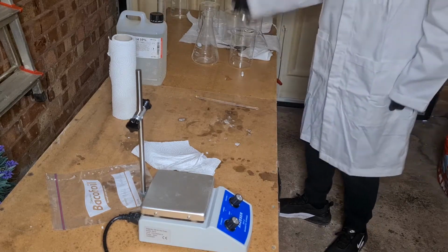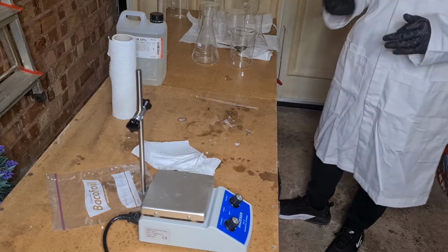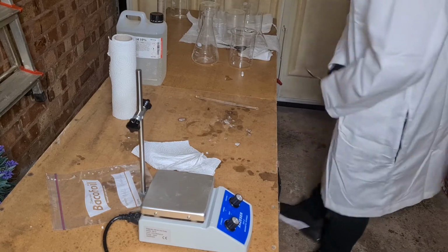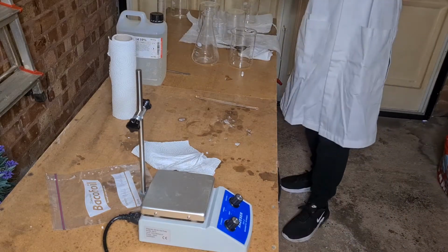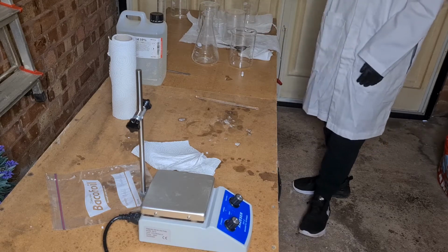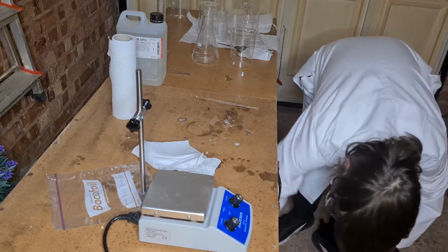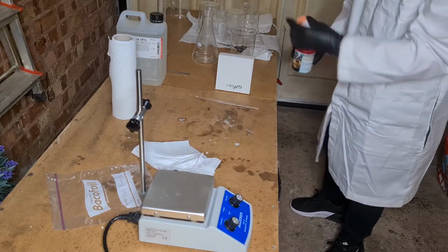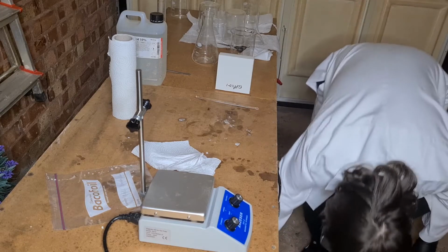Moving on, we have a teaspoon that is never going to be used in making cups of tea ever again. I know it's quite sad considering this was a teaspoon, now it's a chemical spoon. And finally we have this glass funnel. I don't really know what to say, it funnels fluid. And we have on the floor baking soda, bicarbonate of soda, sodium bicarbonate, filter paper, and litmus paper. The litmus paper is supposed to be useful here.